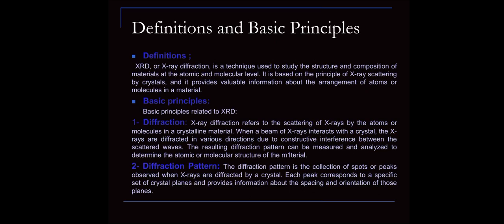Now I will discuss definitions and basic principles of XRD. Definitions. XRD, or X-ray diffraction, is a technique used to study the structure and composition of materials at the atomic and molecular level. It is based on the principle of X-ray scattering by crystals and it provides valuable information about the arrangement of atoms or molecules in a material.